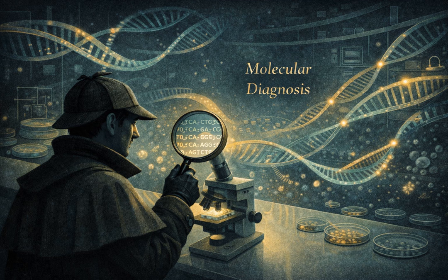Yes, because PCR relies on cycling temperatures to drive a chemical reaction. It's a three-step dance that happens over and over again. And to really get this for an exam, you have to be able to visualize what is physically happening to the DNA at each of those temperatures. Okay, let's walk through the choreography. Step 1 of the dance.